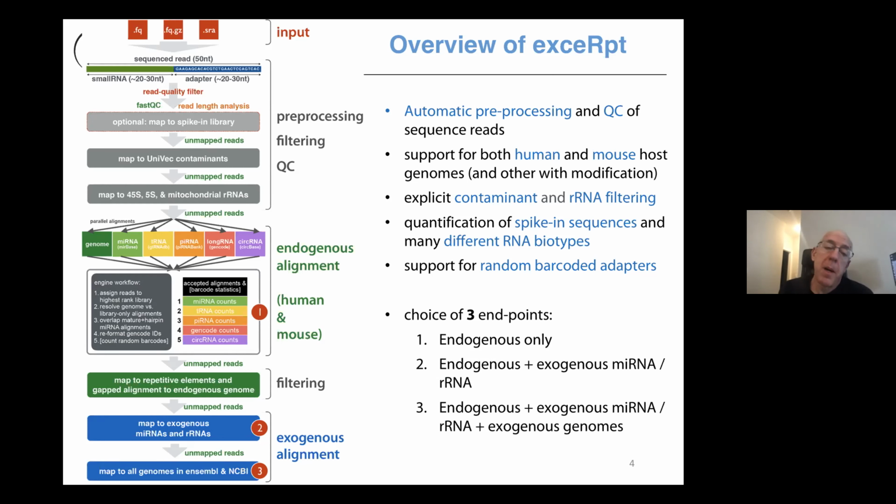By default, the pipeline can work on both human and mouse annotations. And also, as Roger mentioned a little earlier, the quality of the output of the pipeline is contingent on the quality of the annotations. So for genomes such as the human and mouse genome, where high quality annotations exist, this is very successful. For novel genomes or genomes that aren't annotated quite as accurately, one could use this pipeline, except then the limitation is based on the annotations.